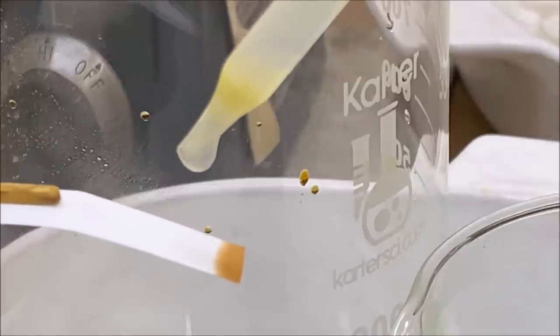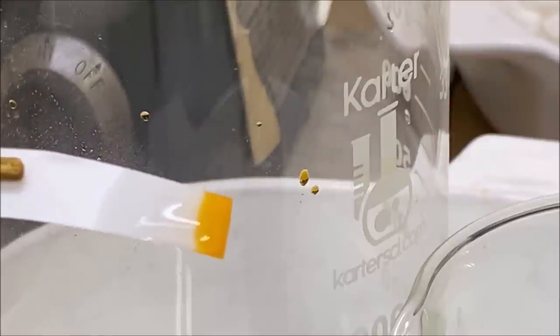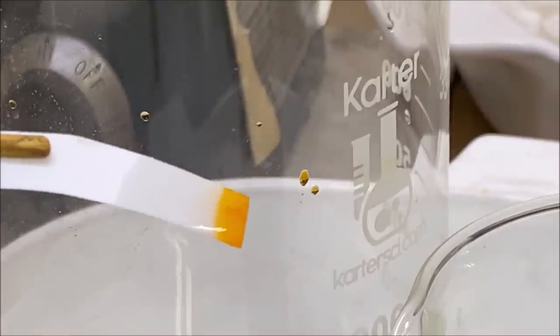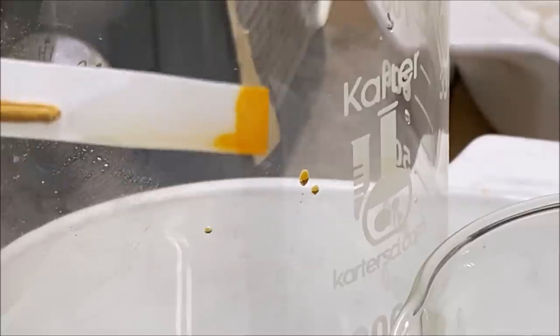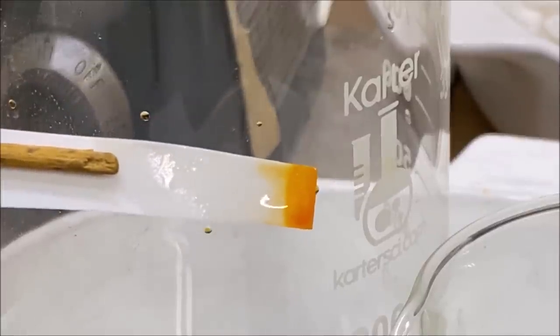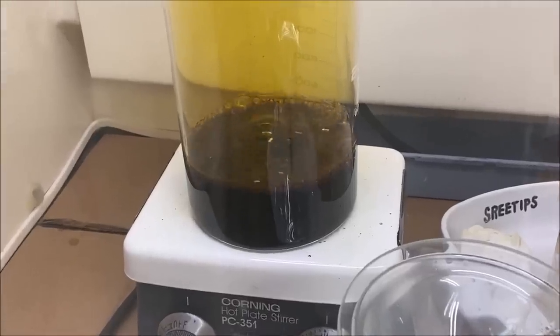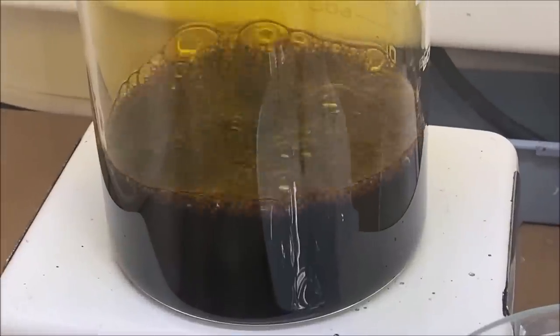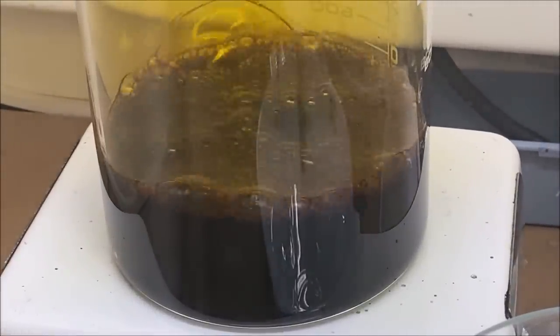We're going to get some on a piece of filter paper here, do a stannous test. There you go. That bright orange color proves that we have platinum in solution. It's fairly high concentration there. And so now what we're going to do is just leave this up on the heat and reduce this down to a syrup to drive off any excess nitric acid that might still exist in that solution.